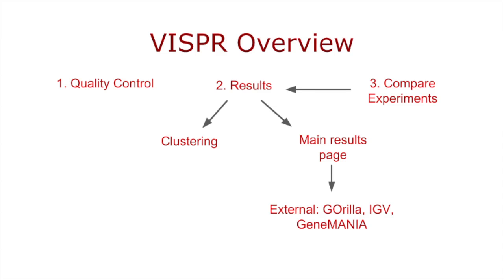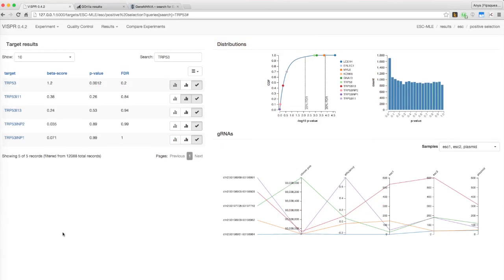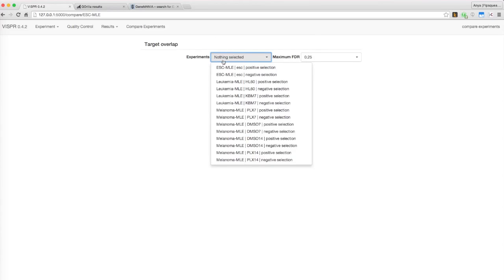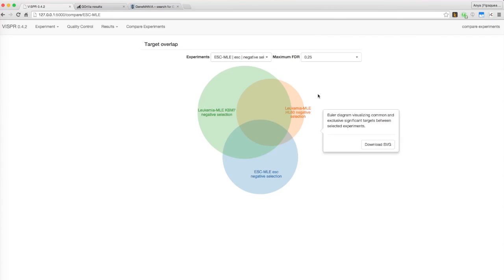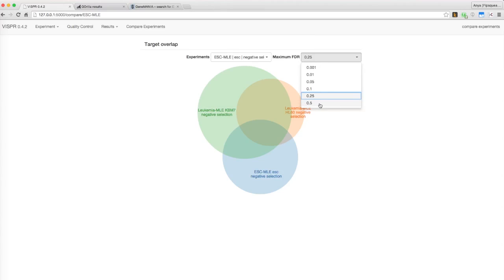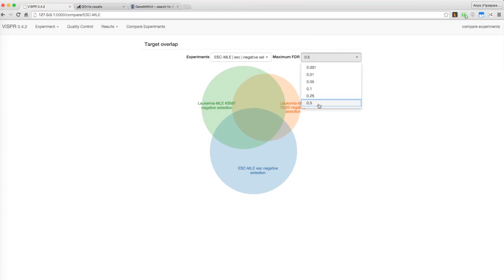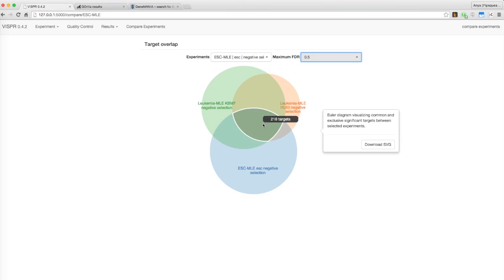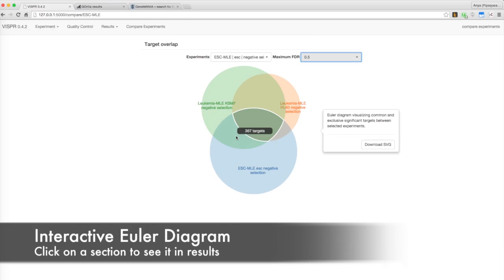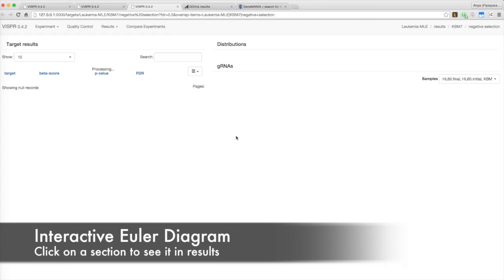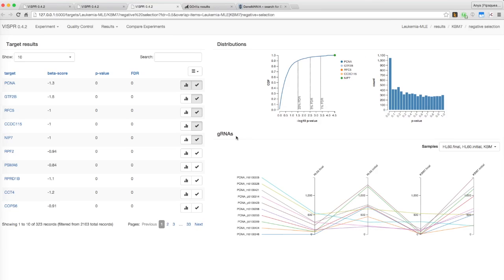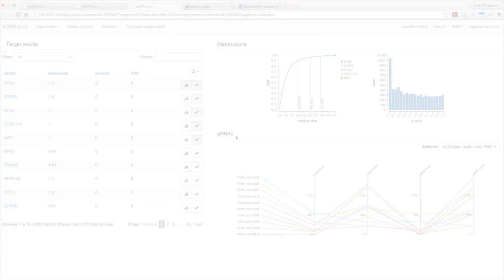Finally, let's see how Visper allows users to compare experiments. Click on the Compare Experiments tab. Here, you can select multiple experiments and see where their significant targets overlap. You can filter the targets included by changing the maximum false discovery rate allowed in the second drop-down menu. Hovering over a section of the Euler diagram shows how many targets fall within it. Clicking on one brings you to the Results page with a table including only the selected targets, which you can then explore further.